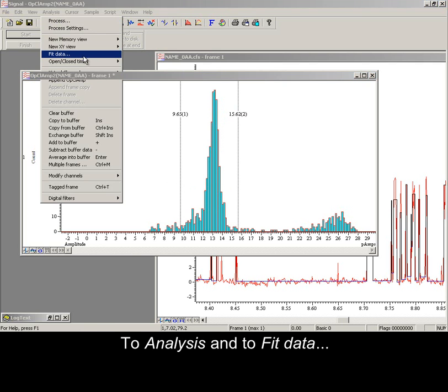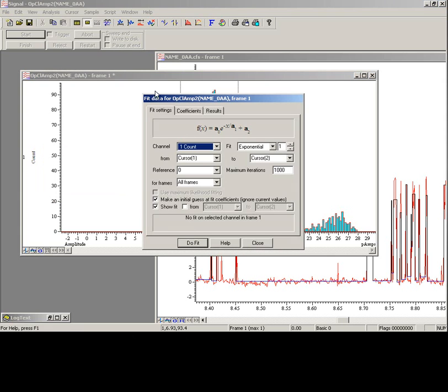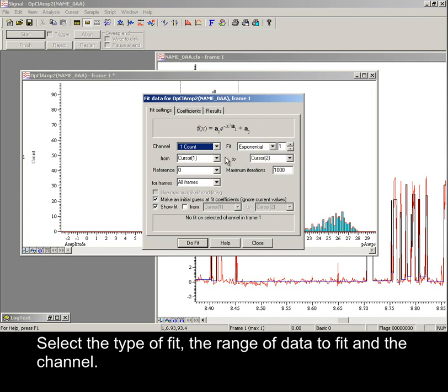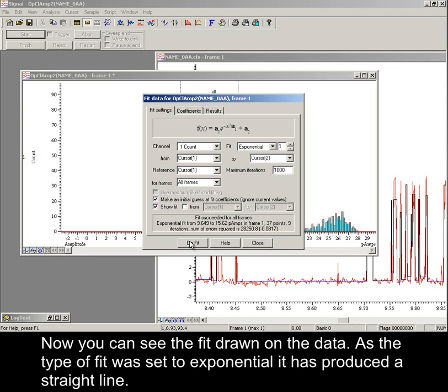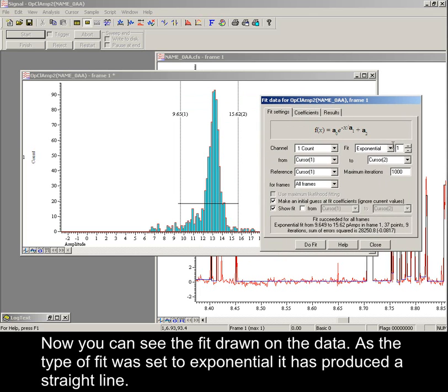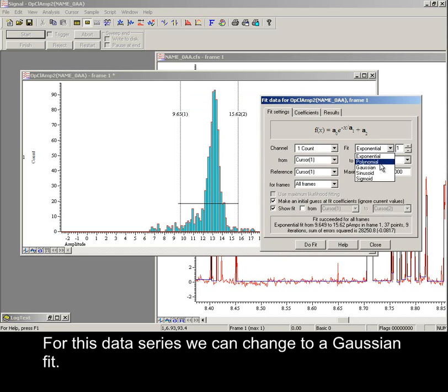To Analysis and to Fit Data. Select the type of fit, the range of data to fit, and the channel. Now you can see the fit drawn on the data. As the type of fit was set to exponential, it has produced a straight line. For this data series, we can change to a Gaussian fit.